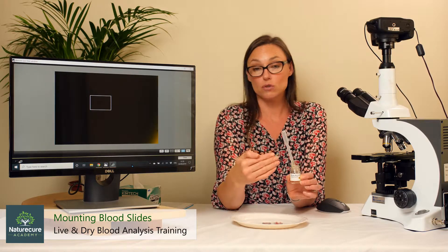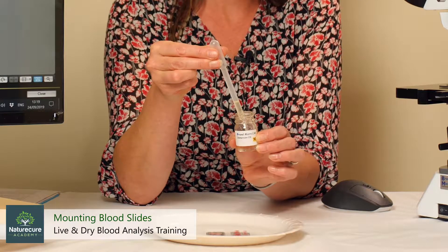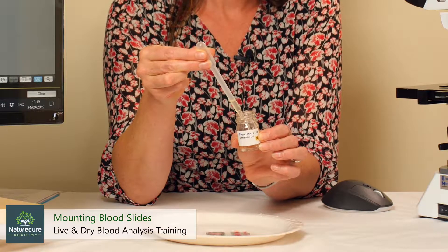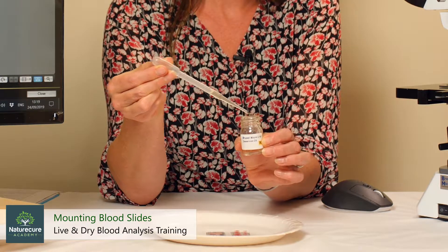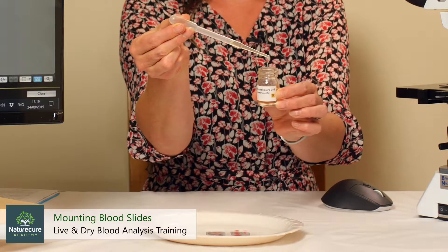Every time you go to use your immersion oil, you always depress the pipette slightly and just hold it — you're just pushing it in just slightly, just trying to keep it in a holding position. And then you just wipe off the edge so that there's no dripping oil.